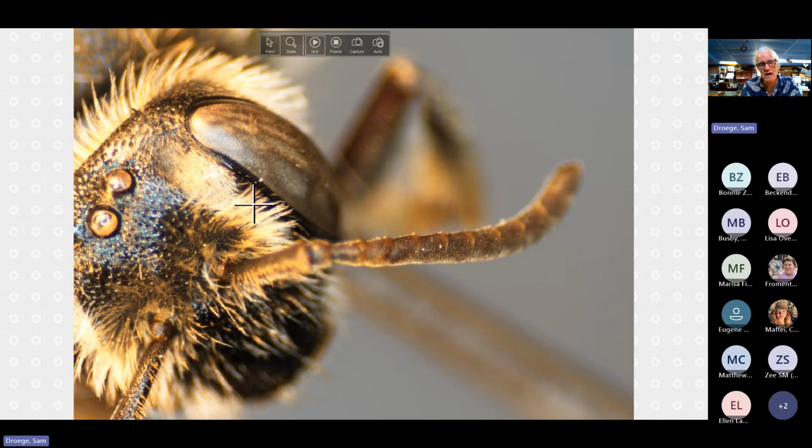So I'm going to try and look at this on the other side too. And here is integument, quite a bit of integument between here. And we usually then look at how much of this integument in comparison to the width of the fovea is there and put that as essentially a percentage. Because sometimes this is way out here and the area of the lower part is quite narrow. And other times this is fairly close, fairly straight, and the area is wide.